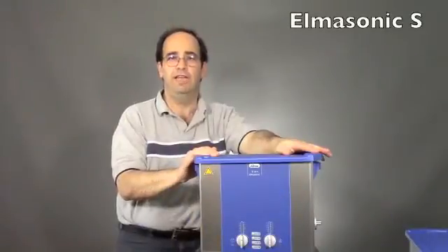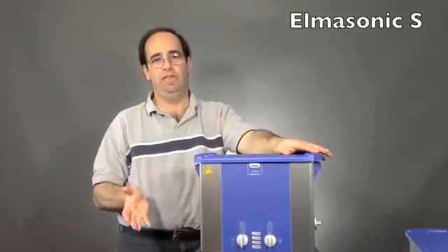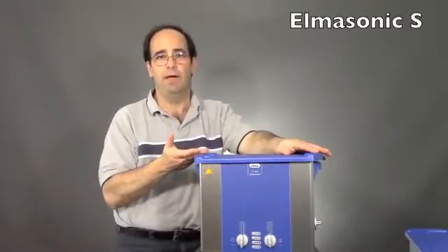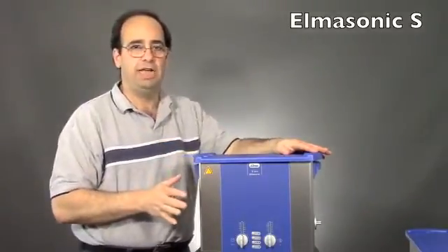Let's move over to the S line. The S line has all the features of the E line, plus for comparable units, about 20% more power. It's also got some really nice features.